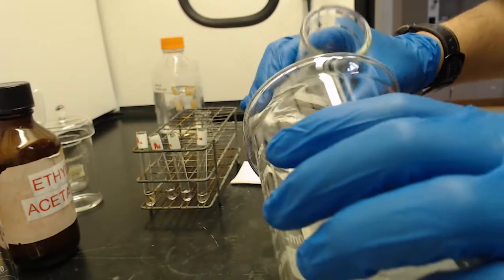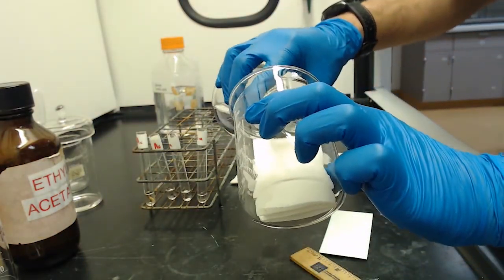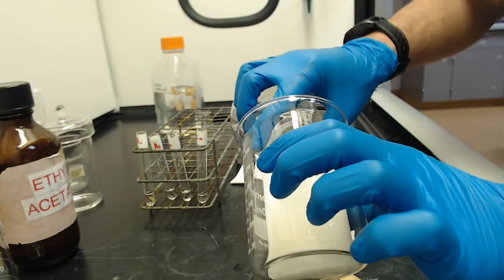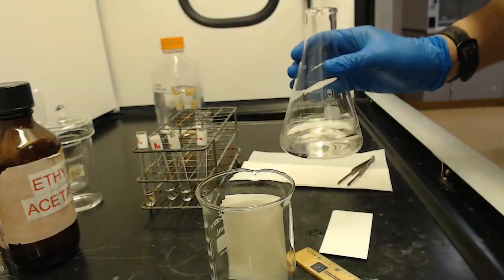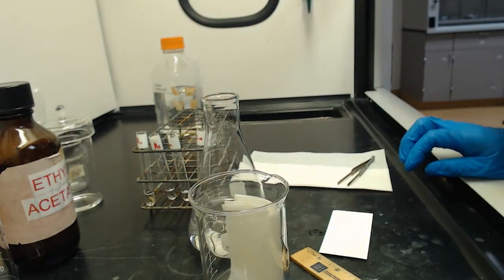And you don't want to use too much here, because remember we have to worry about our solvent level. So I'm just going to saturate this, like so. And then check my height. I think I have enough solvent in there now.